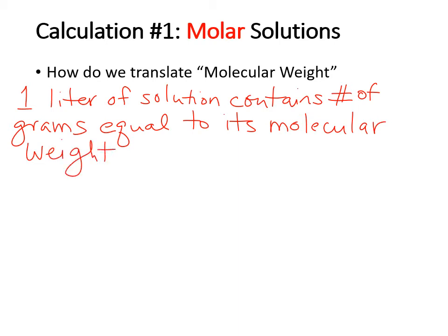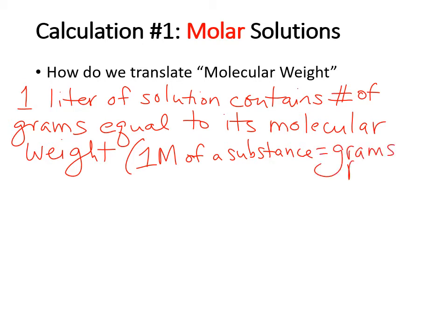So what I'm saying is when you see 1 molar of a substance, that equals grams per liter. You'll see it as G over L.